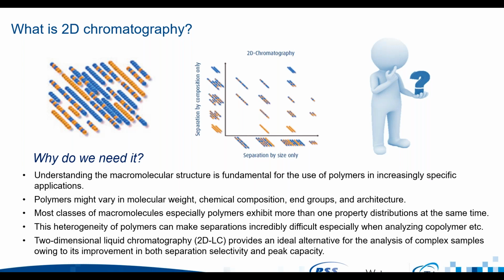So then we are separating by both the polymer's composition, so that's on the y-axis in that graph, and by its hydrodynamic volume, which I mentioned earlier, which is essentially the relative size of the polymer. And we combine that into the same analysis.